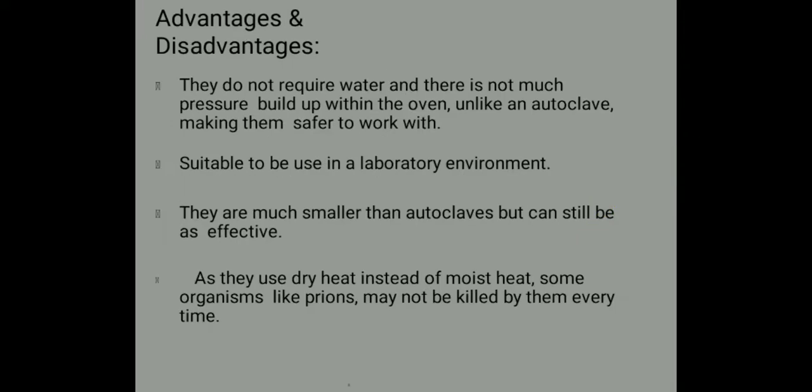Advantages and disadvantages. They do not require water, and there is not much pressure build up within the oven, unlike an autoclave, making them safer to work with. Suitable to be used in a laboratory environment. They are much smaller than autoclaves but can still be as effective. As they use dry heat instead of moist heat, some organisms like prions may not be killed by them every time.